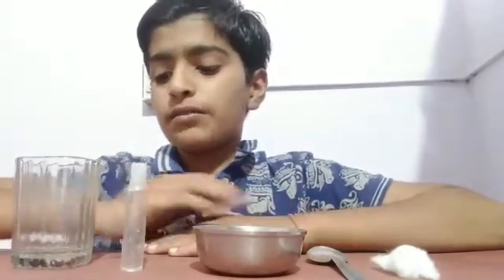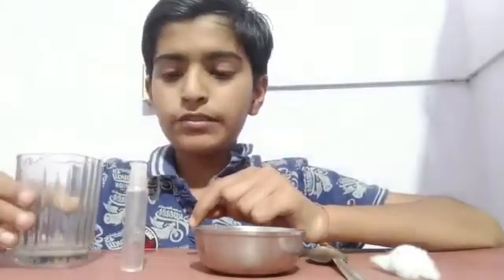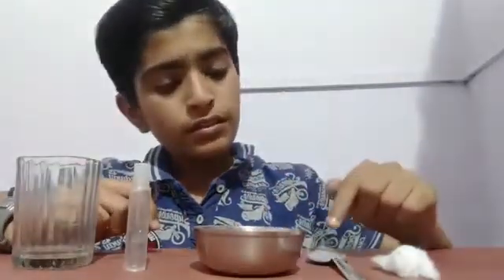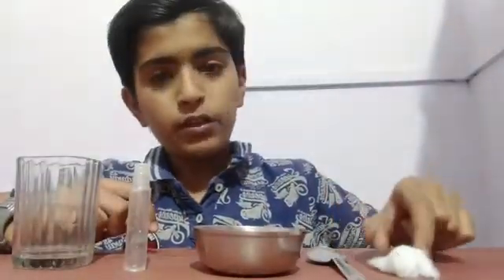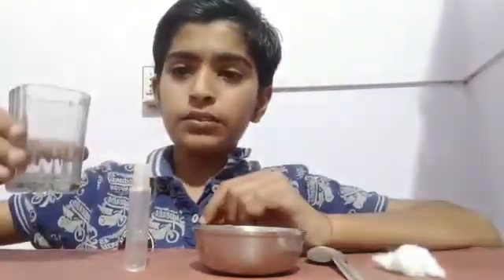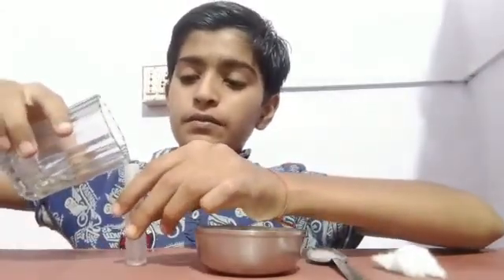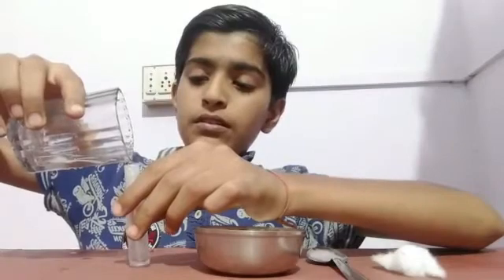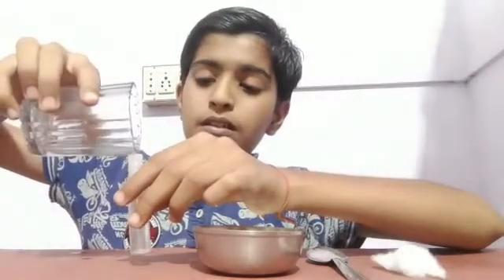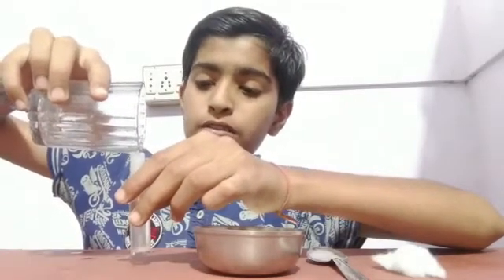So we do this experiment with the help of sugar water, a test tube, yeast powder, a spoon, and a cotton. So firstly we take sugar water and fill the test tube with sugar water.